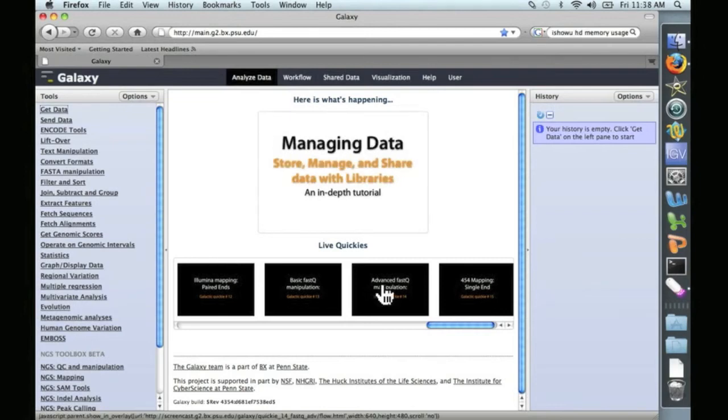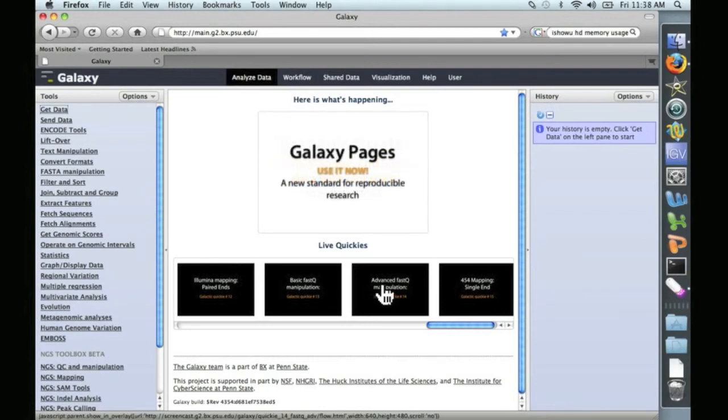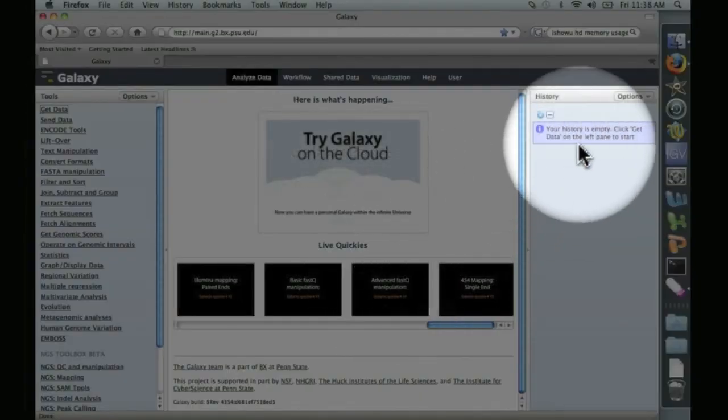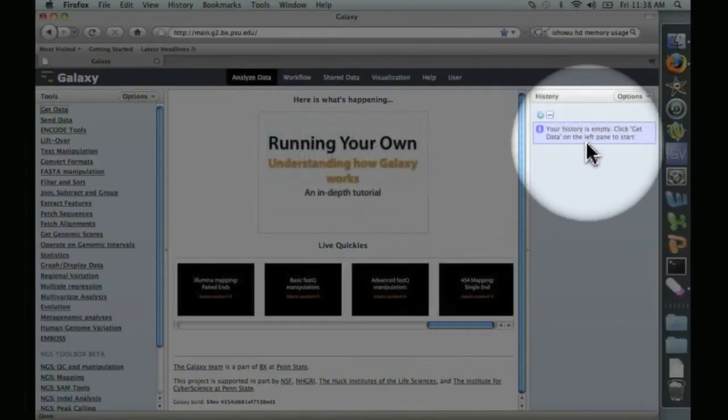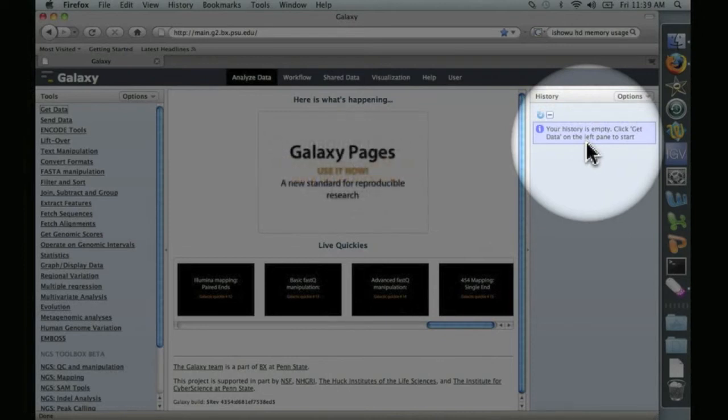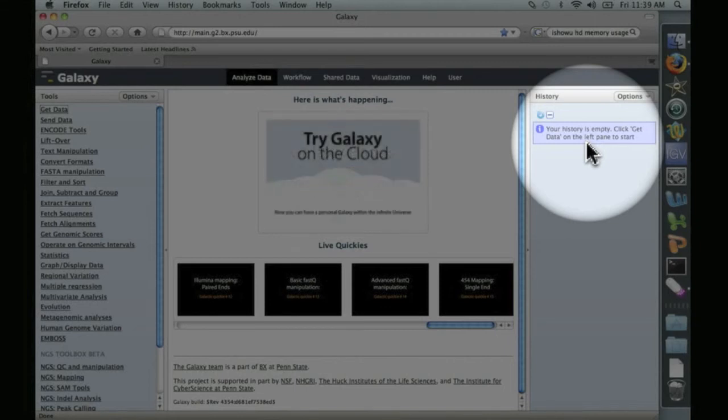All right, well, let's take a little tour. Over here on the right is the history. This is where it will show the sequences that you've uploaded and any manipulations that you've performed in the order that you've performed them.